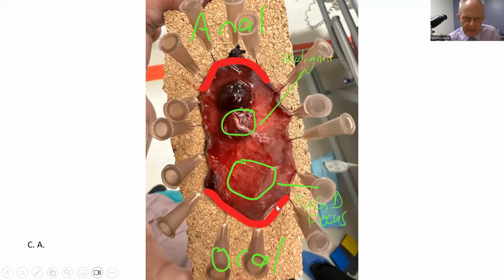The reason I've delineated that as red is that we use 2 inks, to work out where we are in this tumor. The ends of the resection, be it the anal or the oral end, I cover the mucosal surface with red ink, both ends. Then the circumferential or deep margin, if you like, which you can't see here because it's still pinned, but I will show you on the screen, I color with black ink. So when I look at it, I'm able to determine exactly where I am.